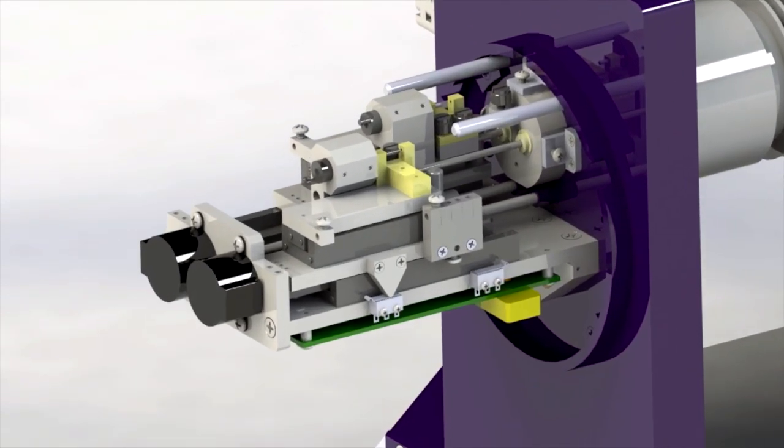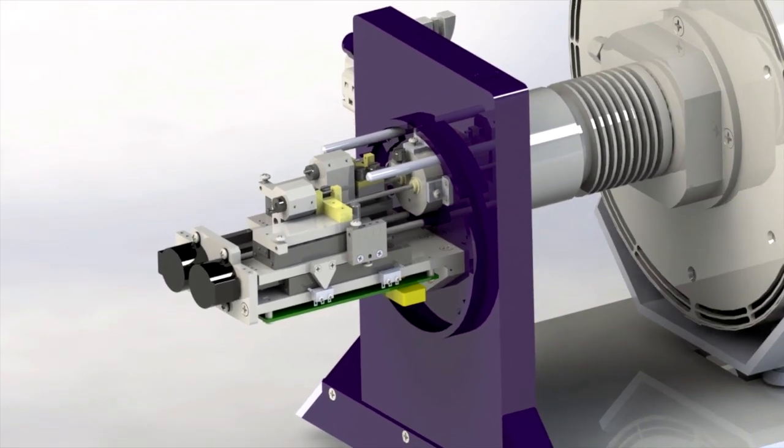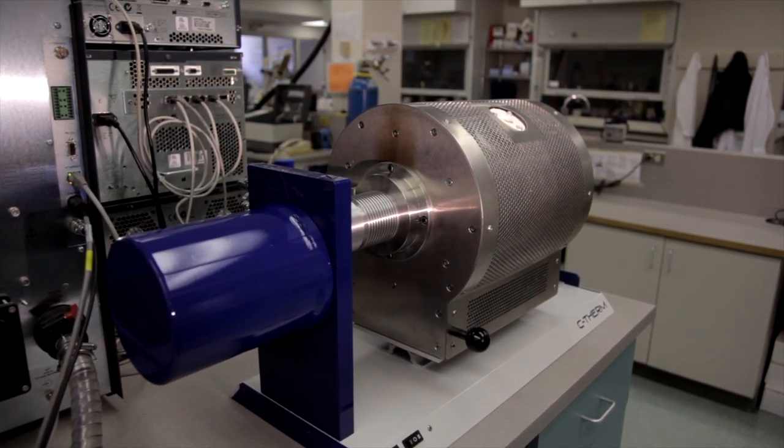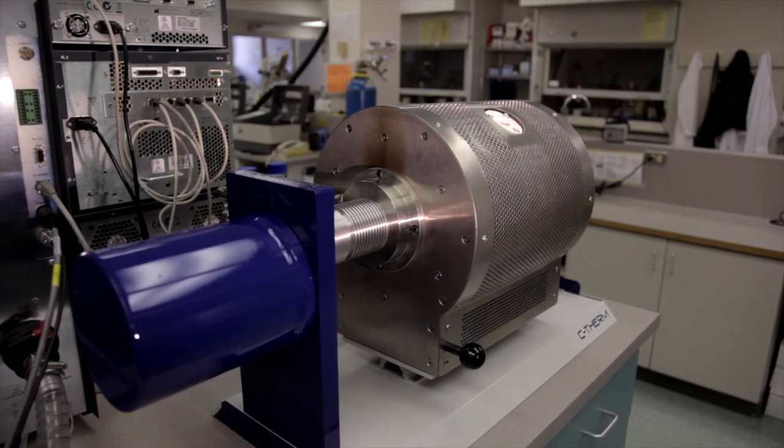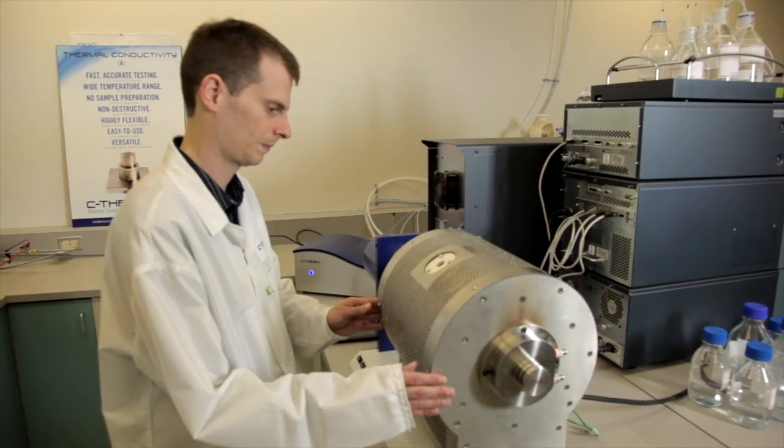The system can be configured as a single or dual rod arrangement with one or two LVDTs with an adjustable contact force of up to one Newton. The horizontal construction offers the best temperature uniformity and allows measurements to be carried out in pure gas environments and under vacuum.